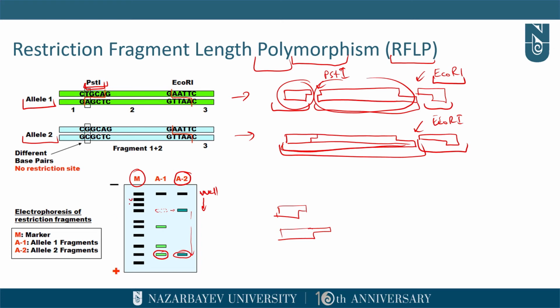So here we have 1, 2, 3, 4, 5, 6, 7, 8, 9 different size fragments of DNA.